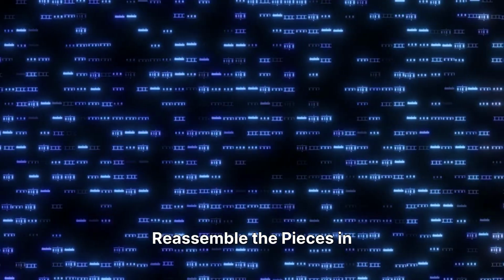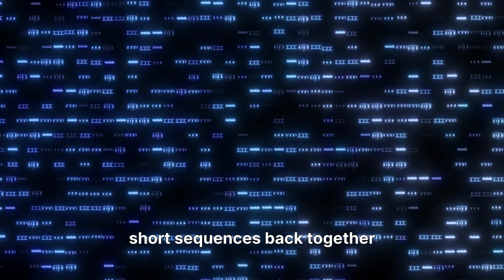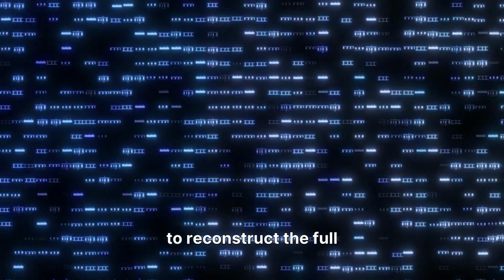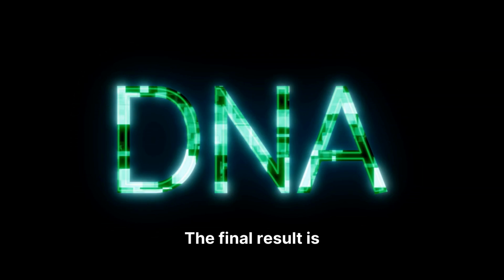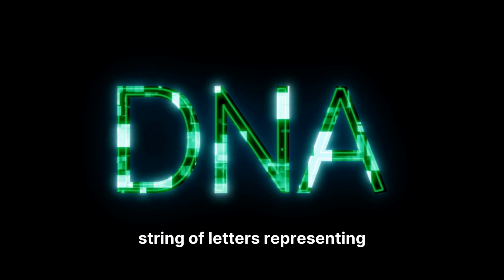Reassemble the pieces in the correct order. Powerful computers stitch the short sequences back together to reconstruct the full DNA sequence. The final result is a digital file, a long string of letters representing the DNA.